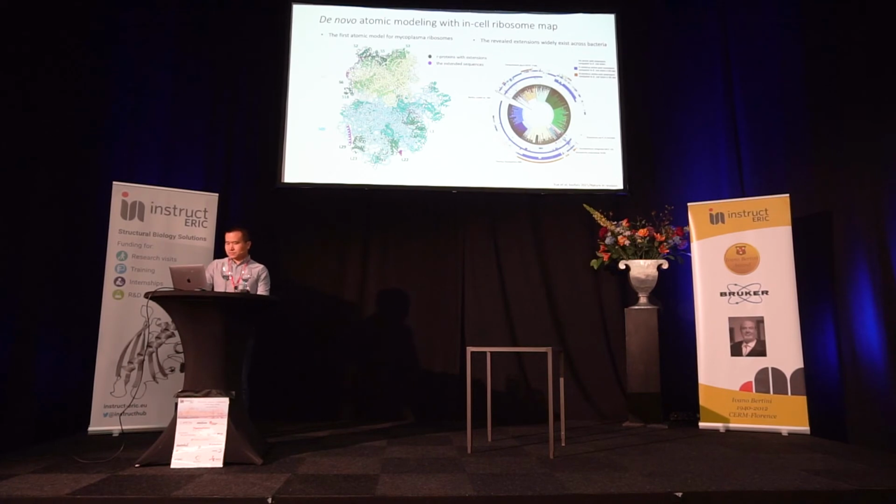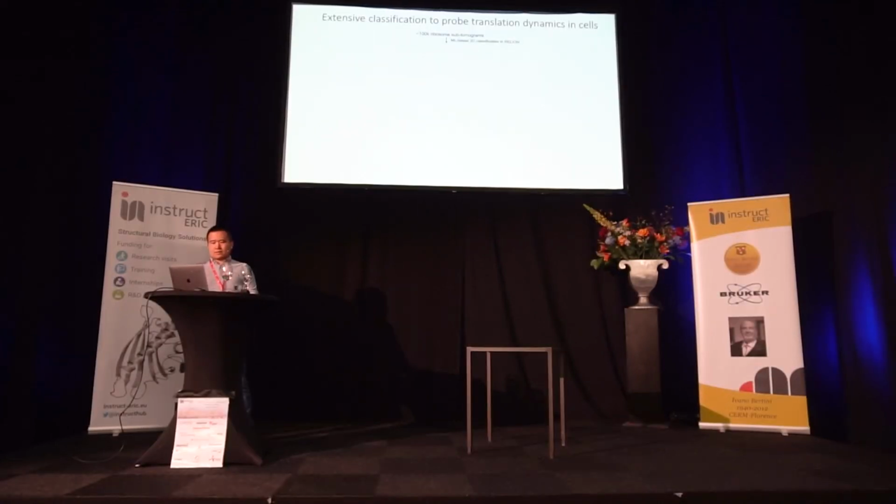Okay, so now that we have a large ribosome dataset from the cellular tomograms, this gives us another unique chance to really determine the dynamic translation process inside bacterial cells. And to do that, I performed extensive computational classification of these ribosome particles using RELION.